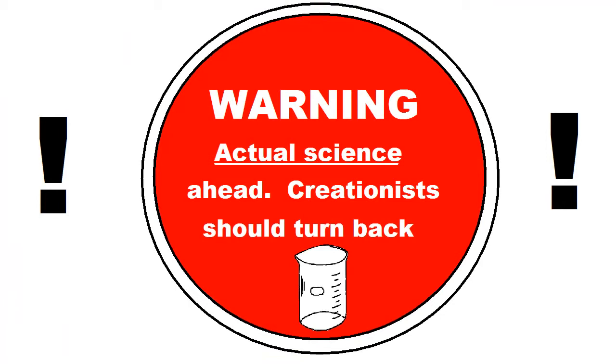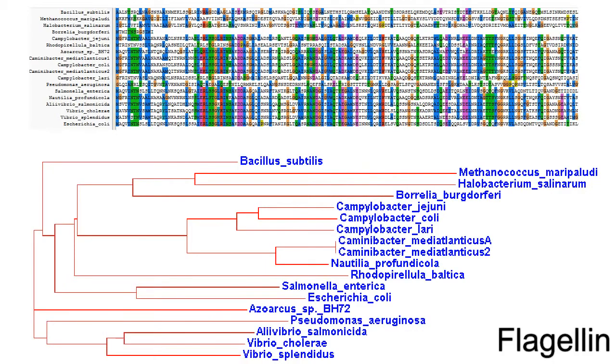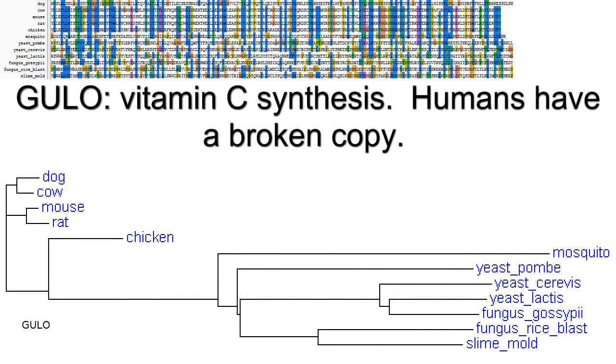Real biologists use these tools. There are no funny animations or lolcats beyond this point. It's just me and some cutting-edge bioinformatics tools up late at night. In this video, I'd like to show you how to construct a phylogenetic tree on your own. Maybe I'm a bio nerd, but I find the process enjoyable, and the results are intriguing.